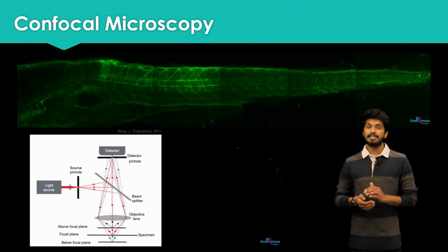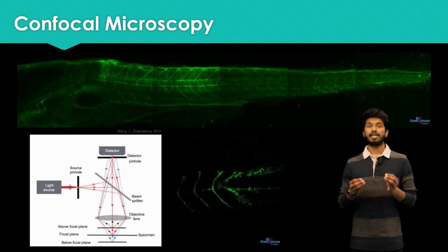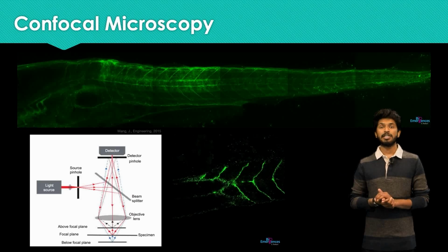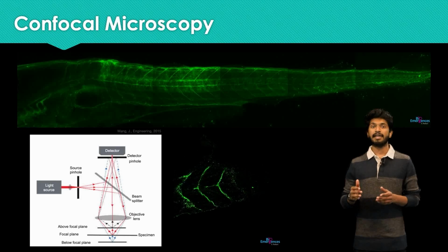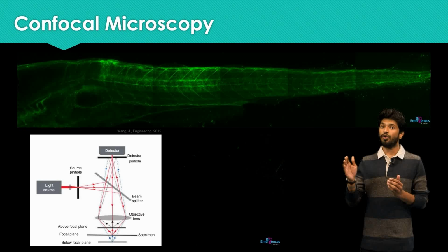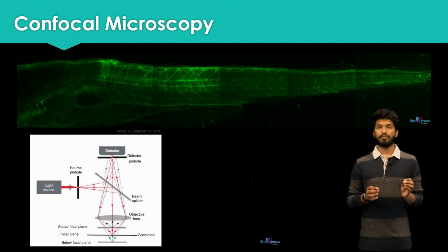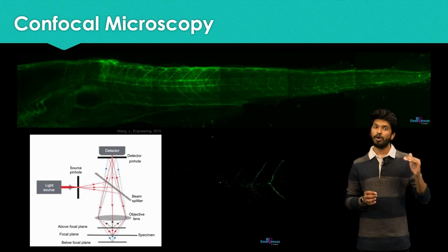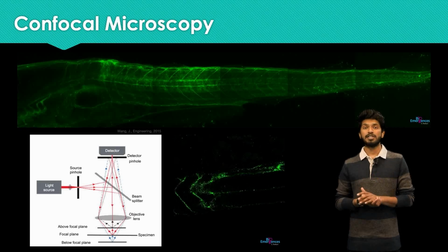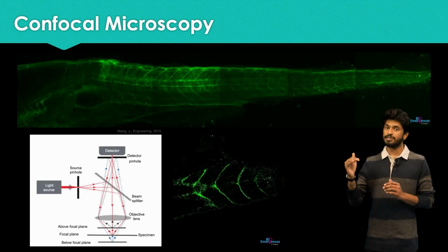Confocal microscopy is extensively used in industry and the scientific community to produce images with a high resolution and contrast. The main principle of confocal microscopy is the addition of a pinhole in front of the detector to reduce the noise and increase the signal-to-noise ratio. In confocal microscopy, only a single point of the sample is illuminated using a pinhole, which allows us to observe the excitation of the fluorophores only in this point.